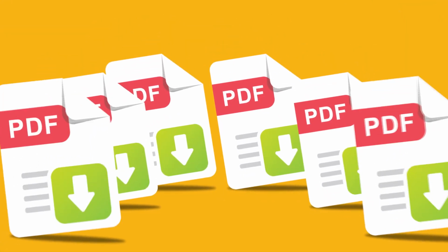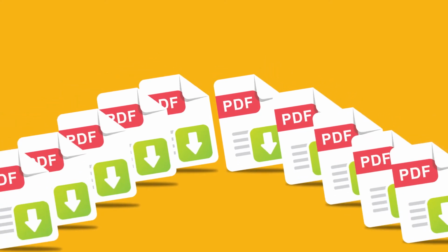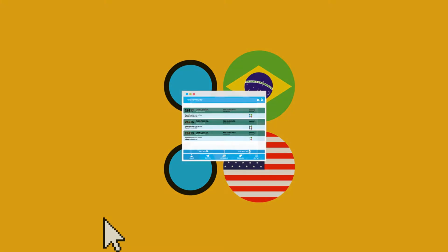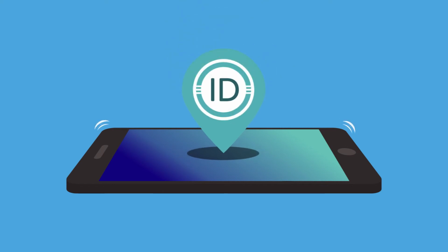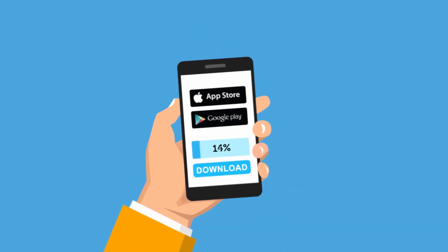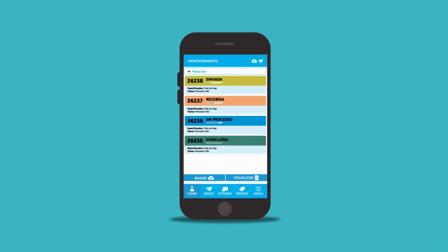With the online FoodChain ID system, you can easily download many assay reports at once. Simply choose the samples, click on the language flag you prefer, and then click on Download or Visualize. If you have our phone FoodChain ID app, it will send a message as soon as the sample analysis is completed. Download the app and make sure you have this comfort in your daily life.